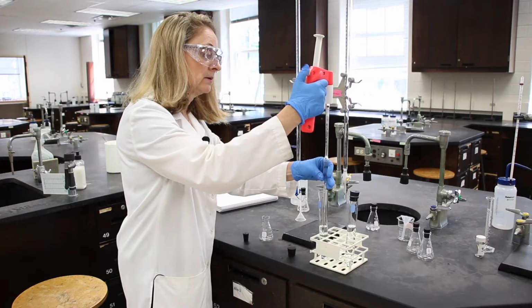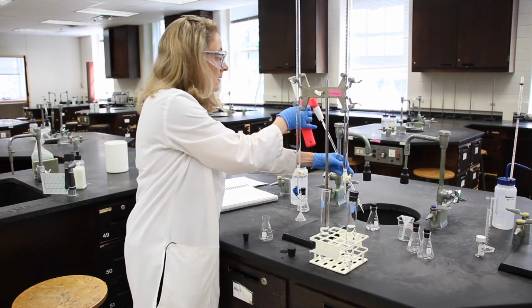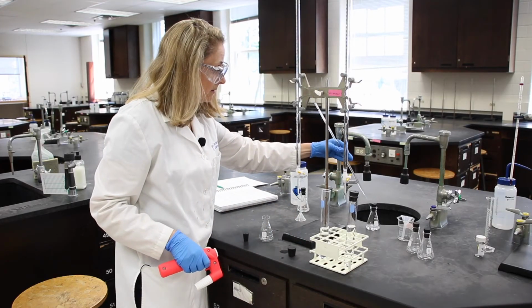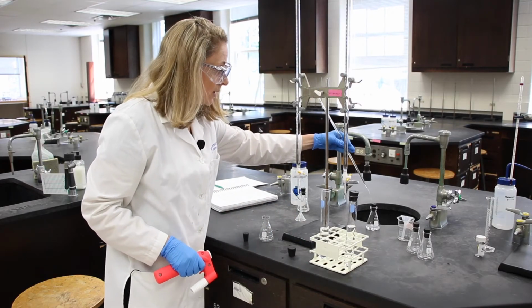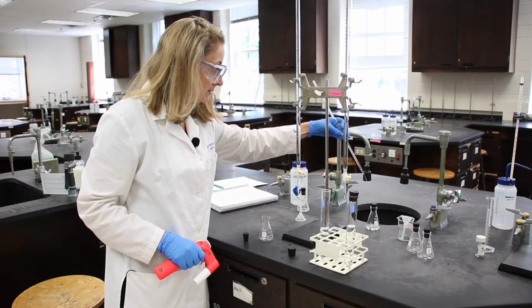Just a little bit above the line, and then we'll put this to waste. So now my pipette is normalized.